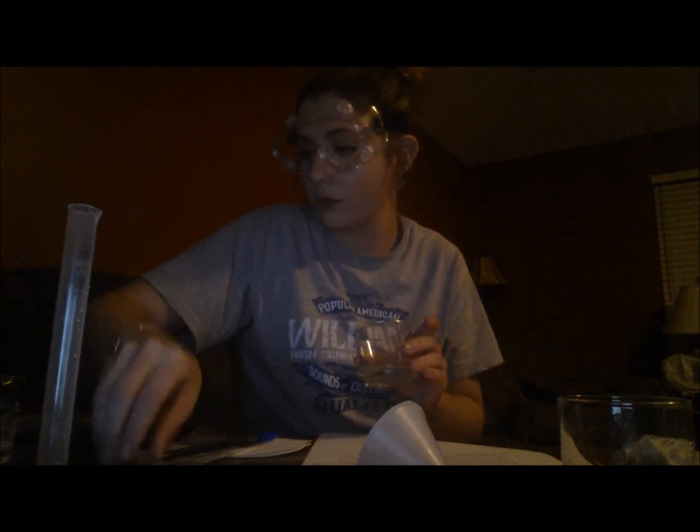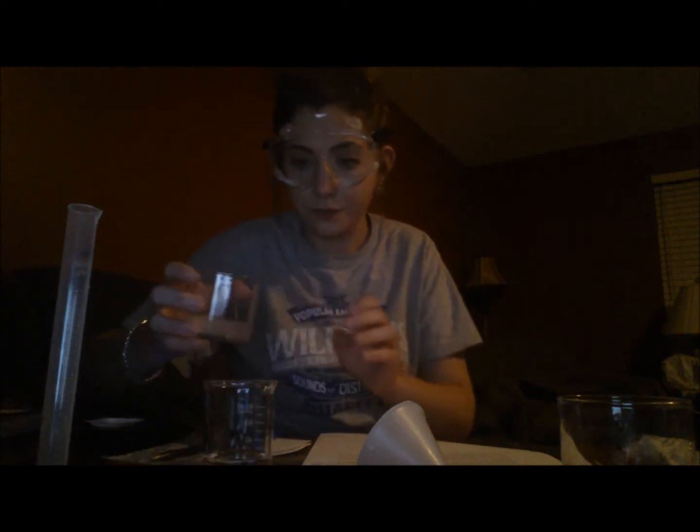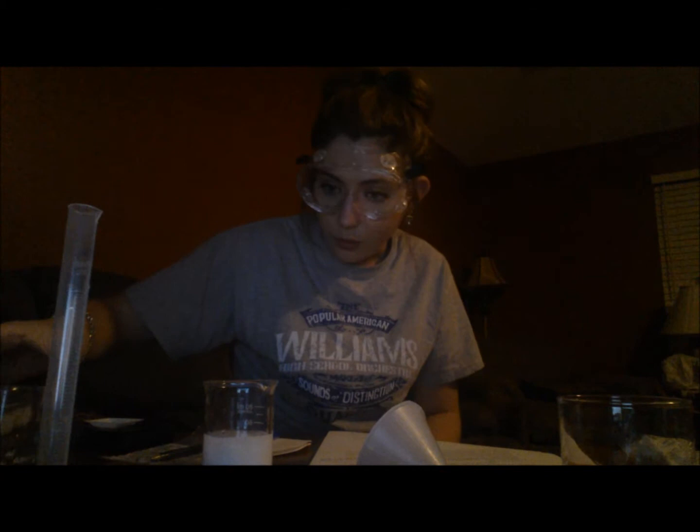There's just a very light precipitation in there. Okay, it's close enough. So here's our beaker with the calcium chloride solution, and I'm going to combine these two. Alright, and we do have a precipitate.